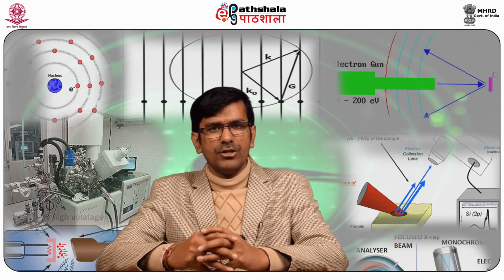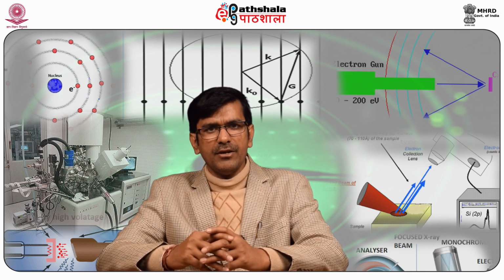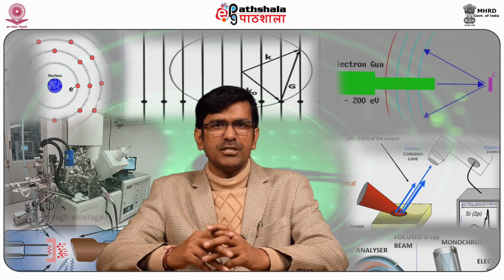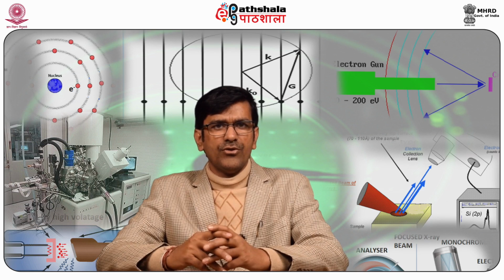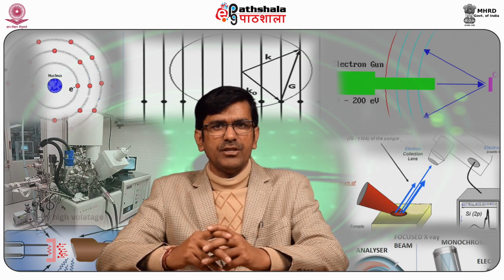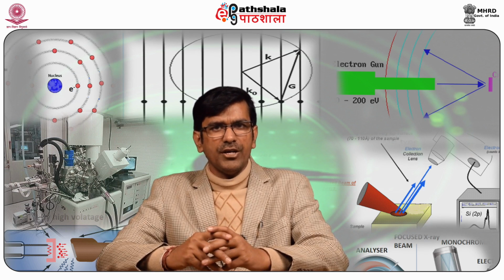Now, about types of splittings, that is spin orbit splitting and multiplet splitting. The first type, spin orbit splitting, is purely an initial state effect which occurs during photoionization if an electron is removed from a degenerate subshell. Another type of splitting is multiplet splitting, which arises when there is an interaction between unpaired electrons formed by the photoelectron ejected and already pre-existing unpaired electrons.